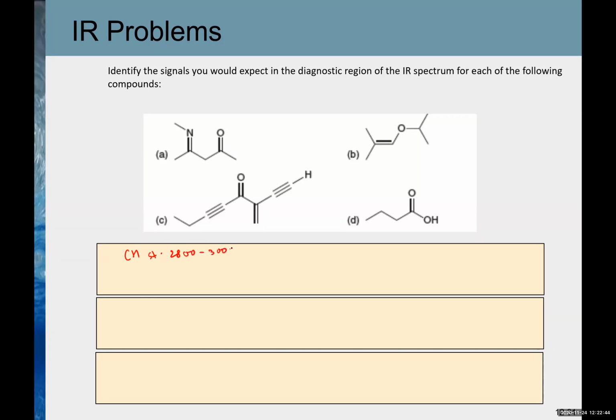Okay. Anything else? Any more prominent peaks? Let's talk about the main prominent peaks. You can look at your data table if you want to. The C double bonded to O, the carbonyl, right? At what position? At 1600 to 1800 or so. Yep.